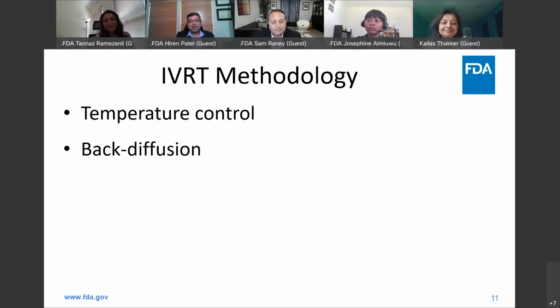I don't have an answer of what is the percentage that is acceptable, but I would just echo what we discussed earlier. Please do a visual inspection of your donor chamber, and if you see some abnormality in your donor chamber, please report it.